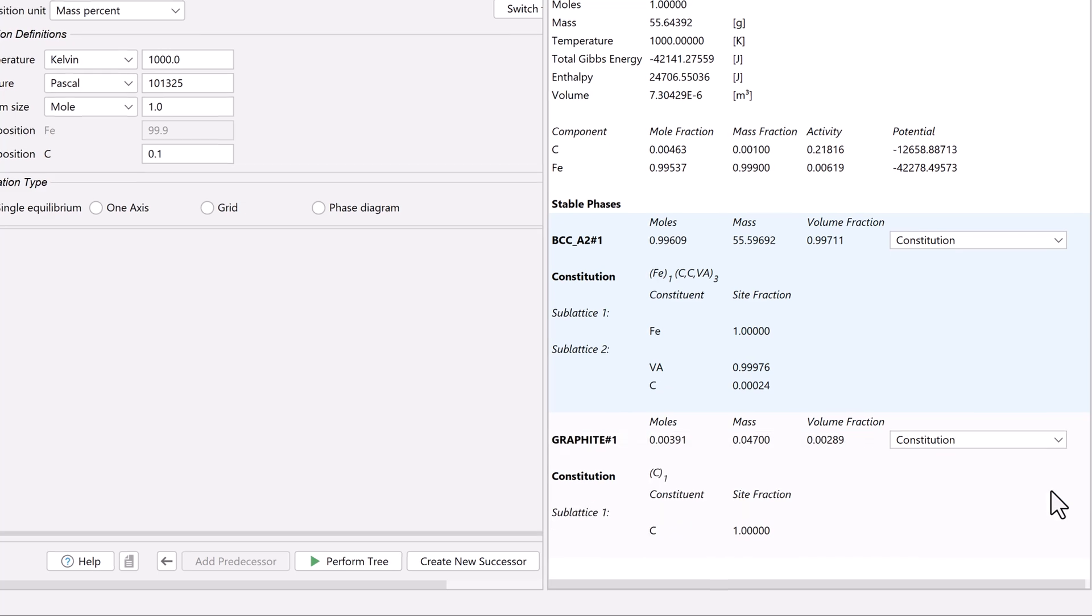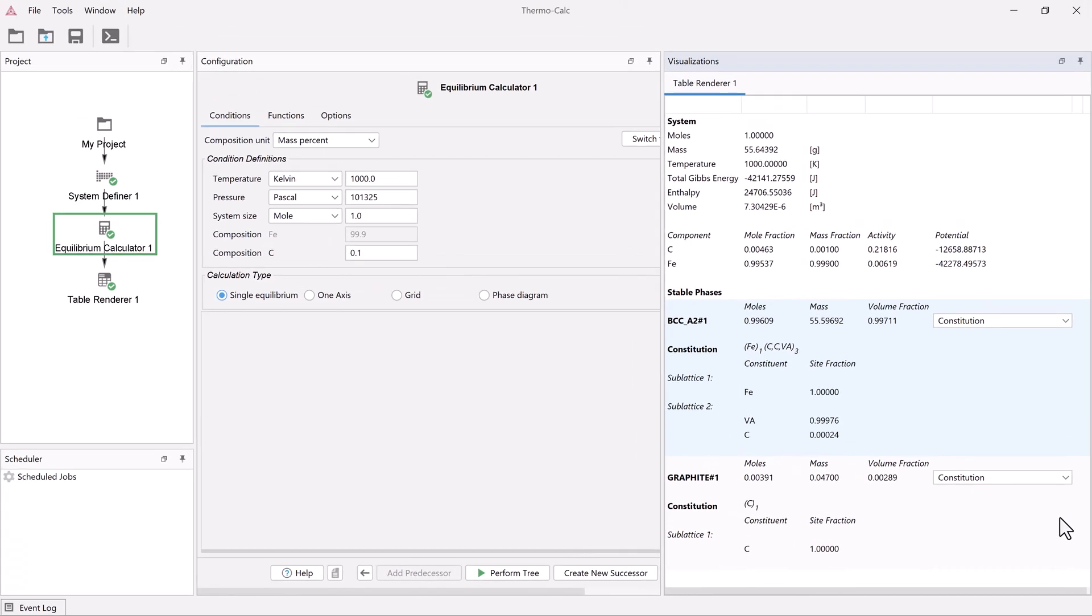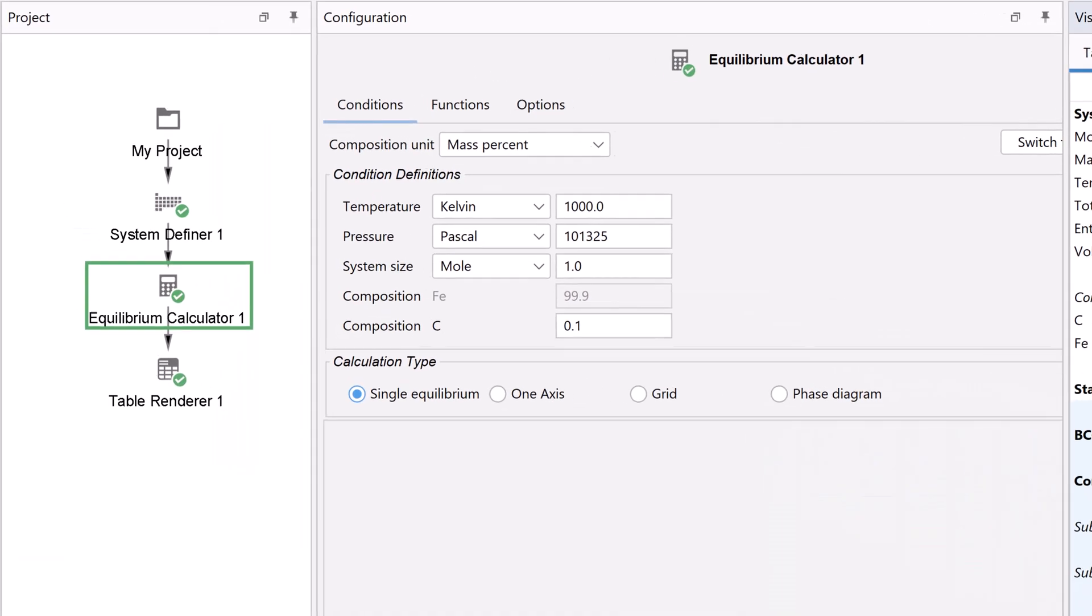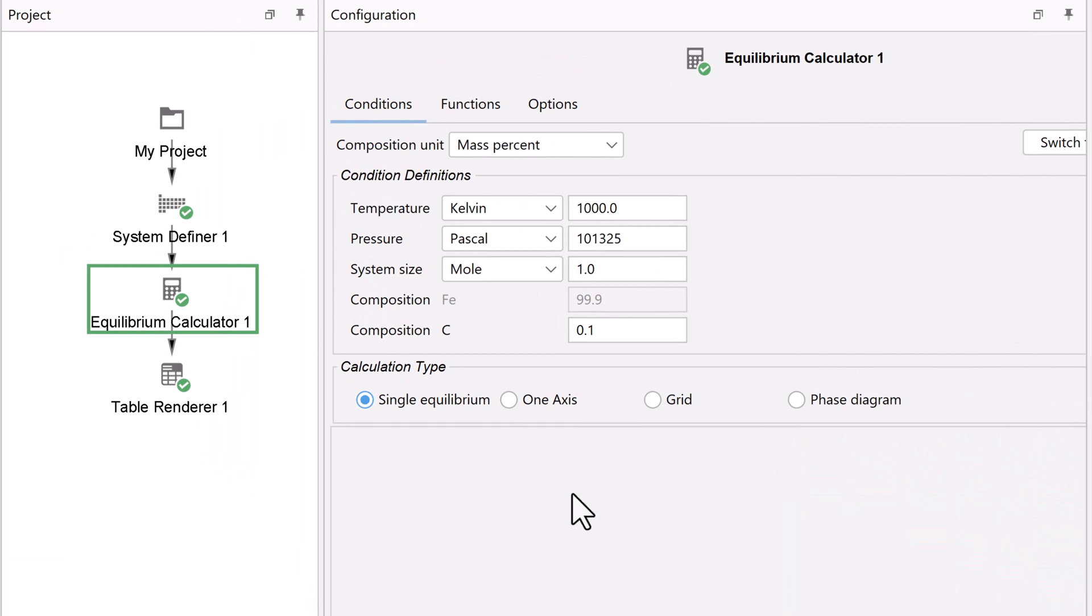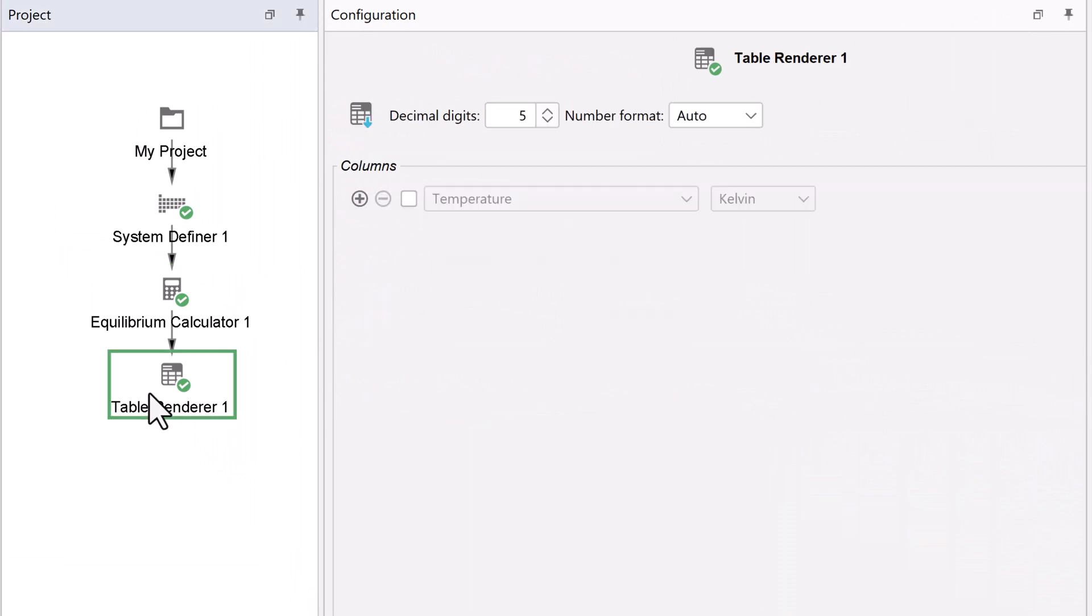You may have noticed that we never configured the table renderer node. This is because a single point equilibrium calculation automatically provides you with a lot of information about your calculation. But you can view even more. Click on the table renderer node.